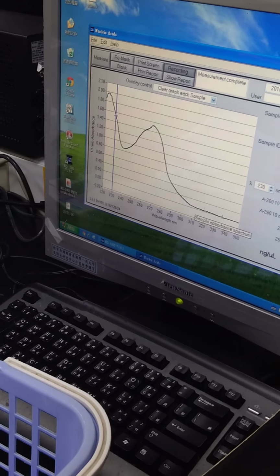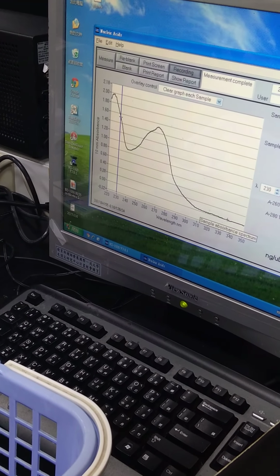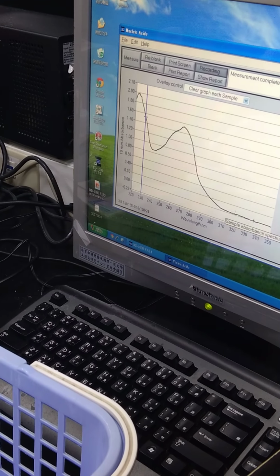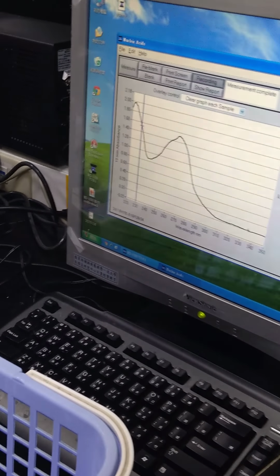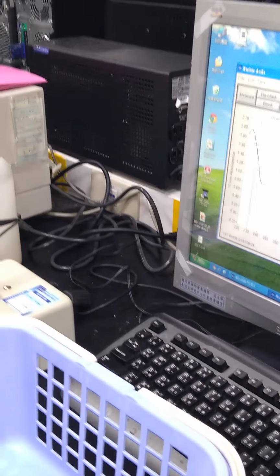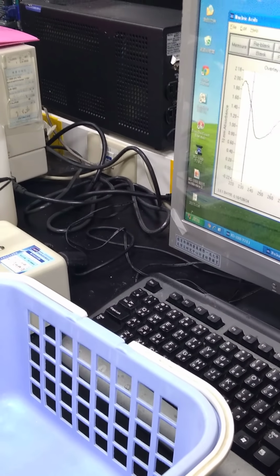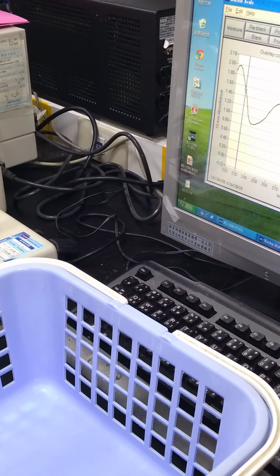Because this time we didn't do the RNA purification, maybe the quality is not really good. I think that is one of the reasons, so we are supposed to purify first. Usually, if you want to get more accurate RNA, you should do the purification step. Yeah. Okay. Do you have to wash in between samples? No. Usually, when I operate, I will not wash it.